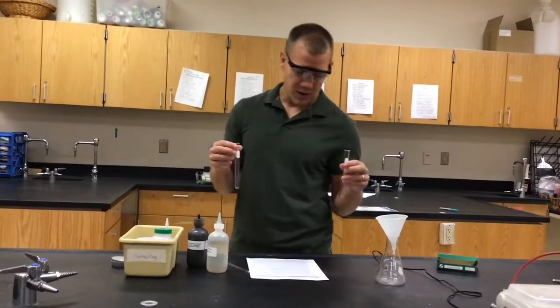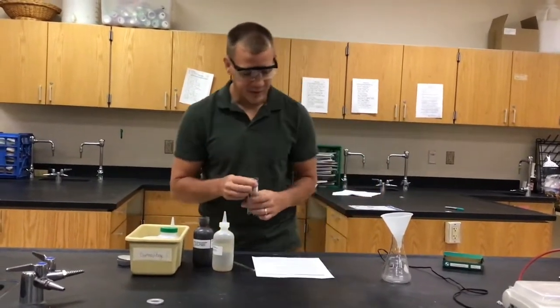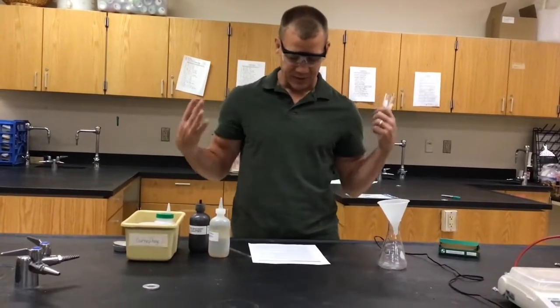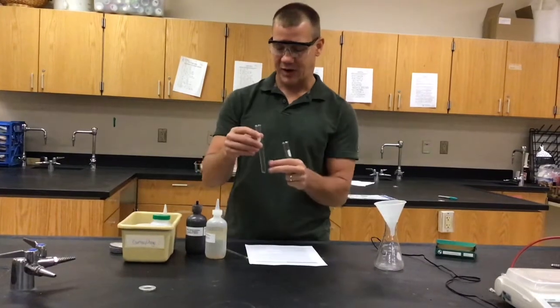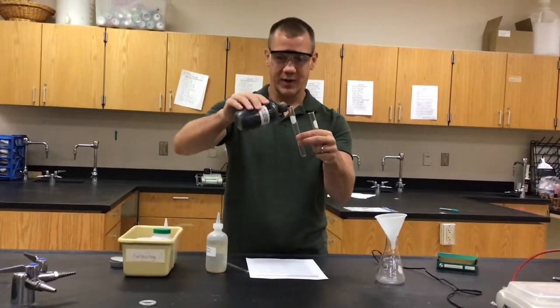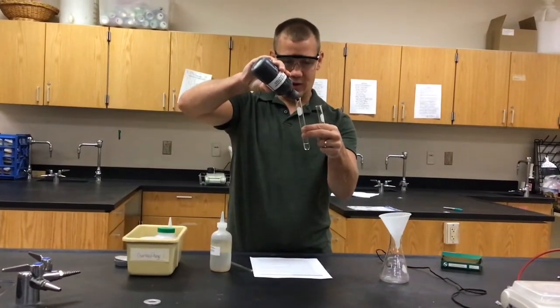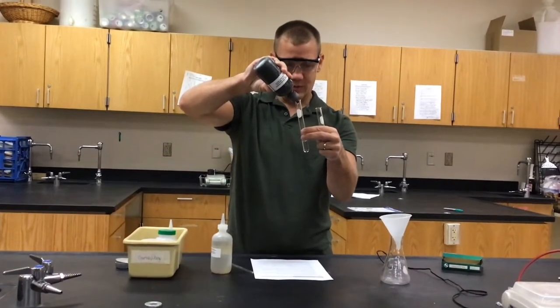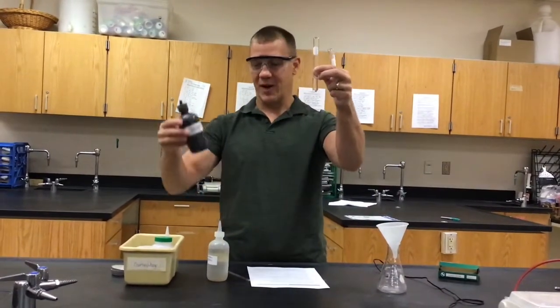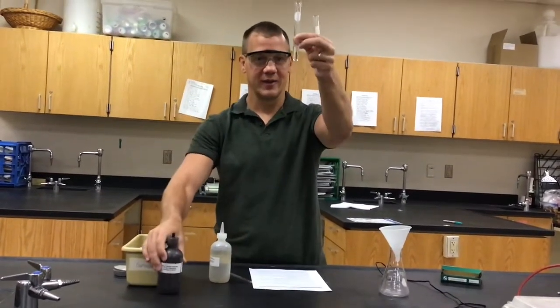We're going to do lab 3-1. The first part of the procedure says to add three to four milliliters of silver nitrate — when something says three to four, that's just approximate. The silver nitrate reacts with light oftentimes and will also stain your skin if you get it on you. The bottle is kind of stained silver, but you can see it's a clear liquid.